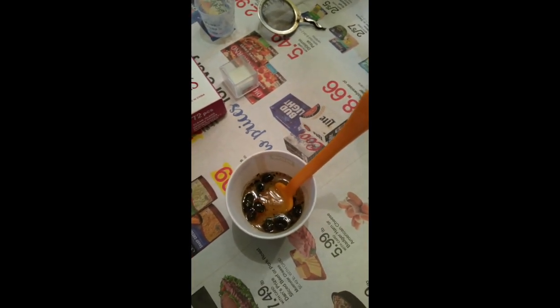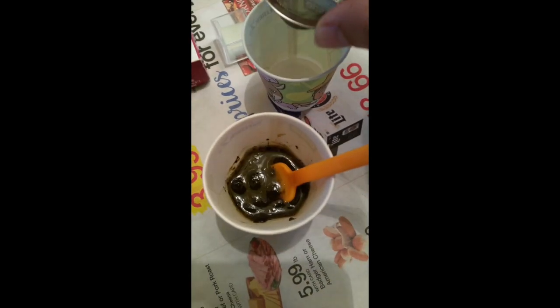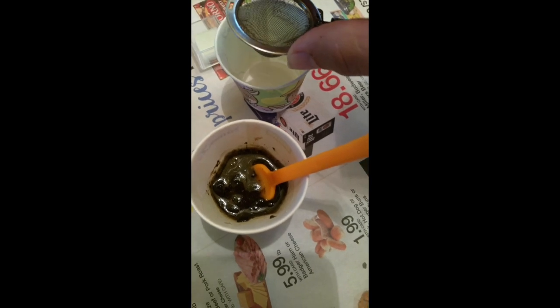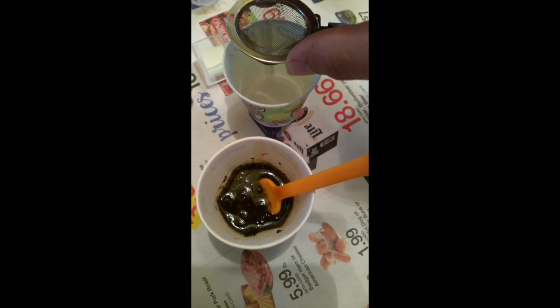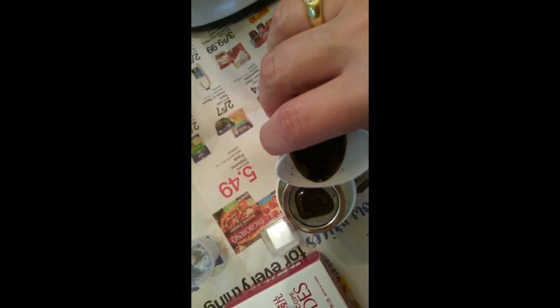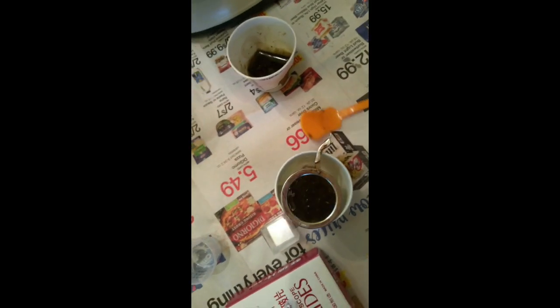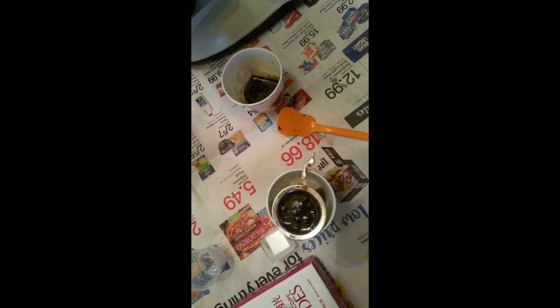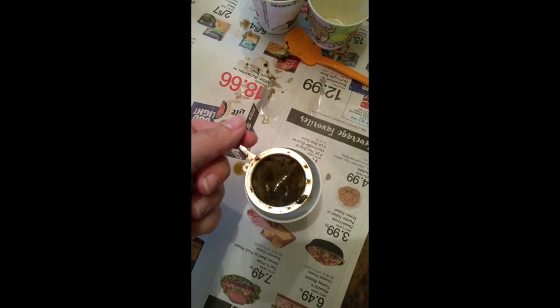This is where the smelly part comes in - it's really starting to smell now. Still stirring, I'm really close. I'm going to take this cup and pour my little slurry through here into there, then mush it with my little frozen yogurt spoon. I need my other hand - I just about flopped it right into my face!